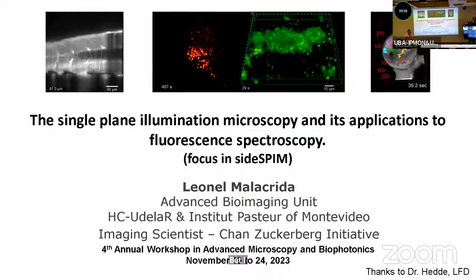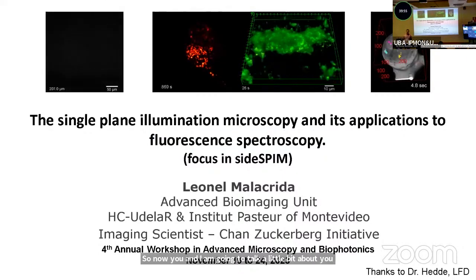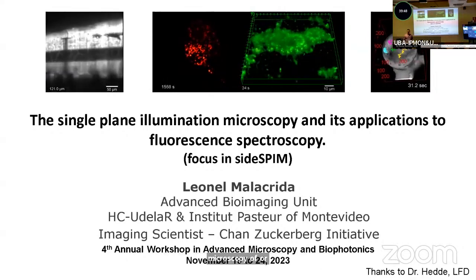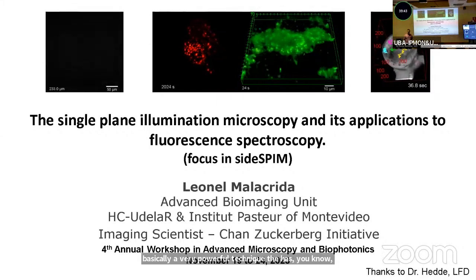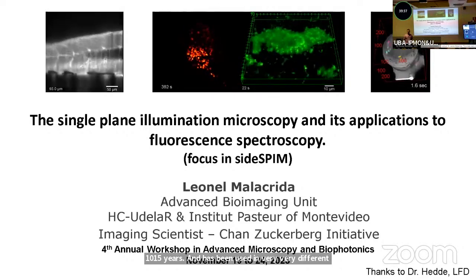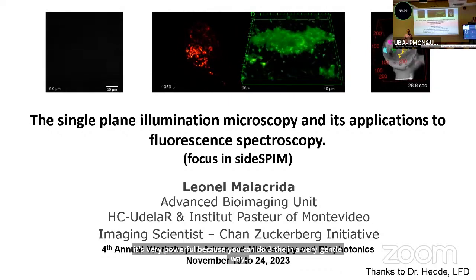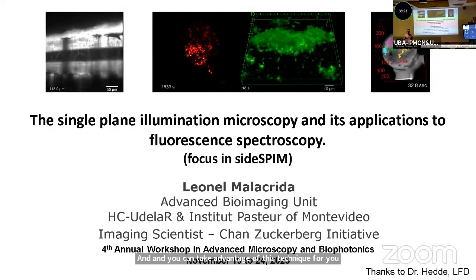So now it's my turn, and I am going to talk a little bit about light sheet. So SPIM, single plane illumination microscopy, or light sheet microscopy, which is basically a very powerful technique that has been developed in the last 10, 15 years, and has been used in very different situations and very many different applications. And it's very powerful because you can do 3D imaging in a very gentle way, and you can take advantage of this technique for embryo studies, with cells, with many other applications.